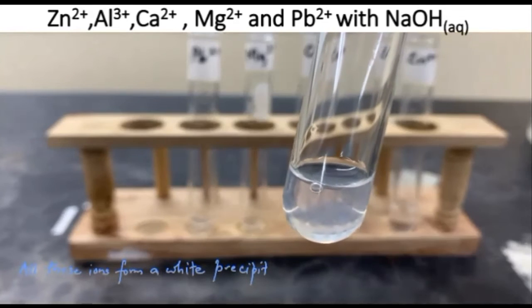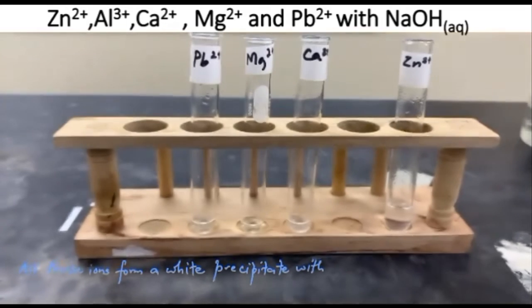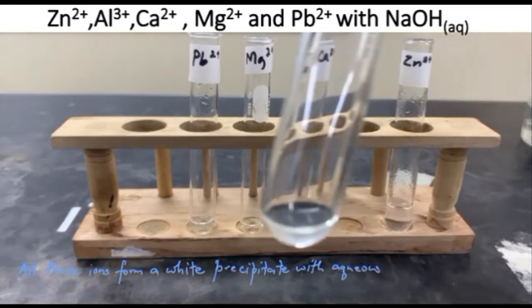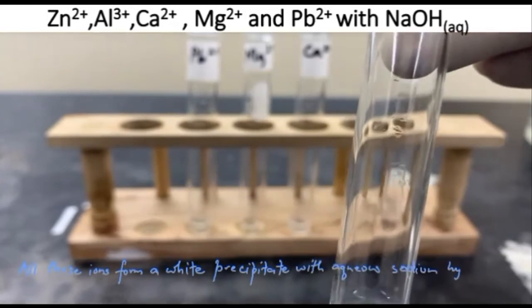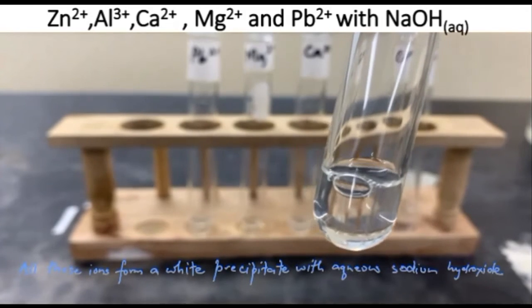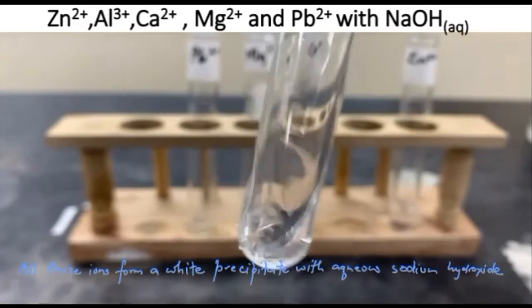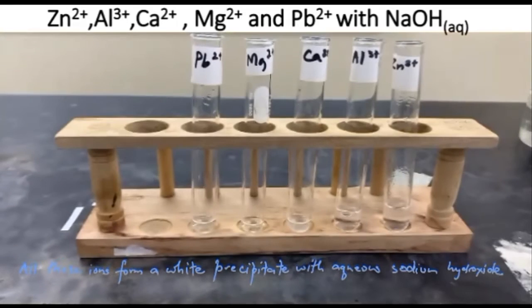So we're going to pour off a little of the substance so we can now add our sodium hydroxide in excess, and adding the sodium hydroxide in excess has caused our precipitate to dissolve.